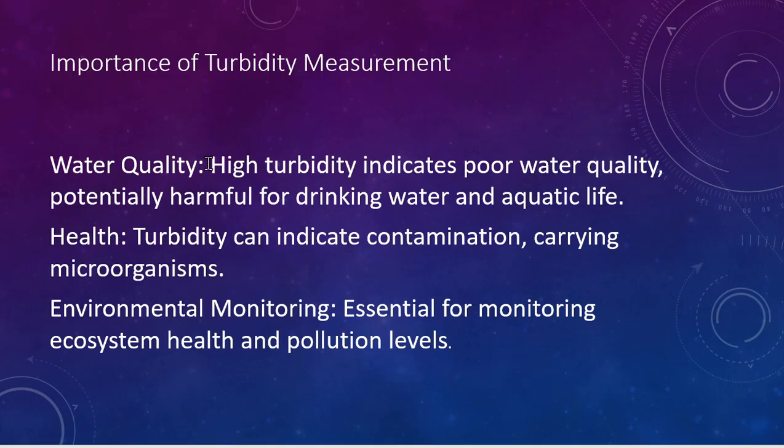Now we will discuss the importance of turbidity measurements. It is important for measuring water quality. High turbidity indicates poor water quality, potentially harmful for drinking water and aquatic life. It is also used for health purposes, as turbidity can indicate the presence of microorganisms.